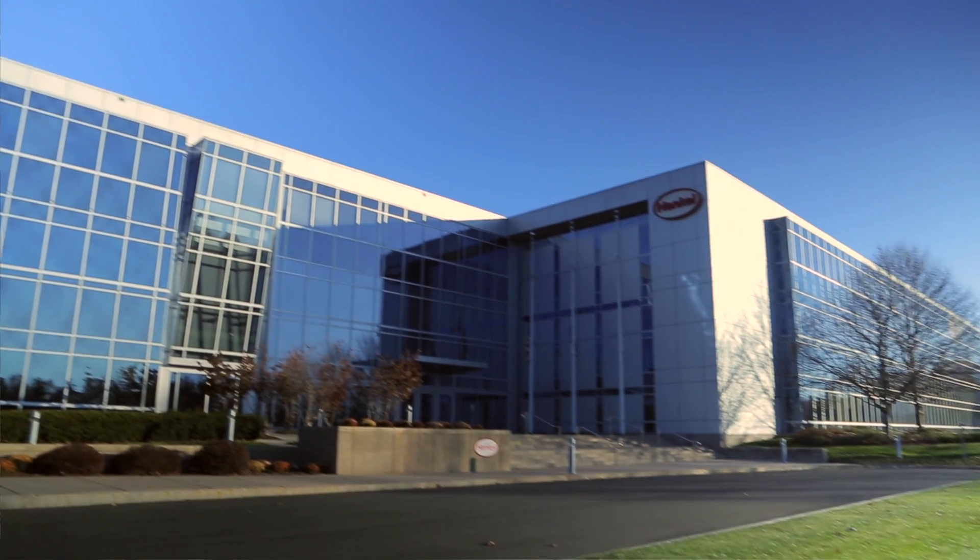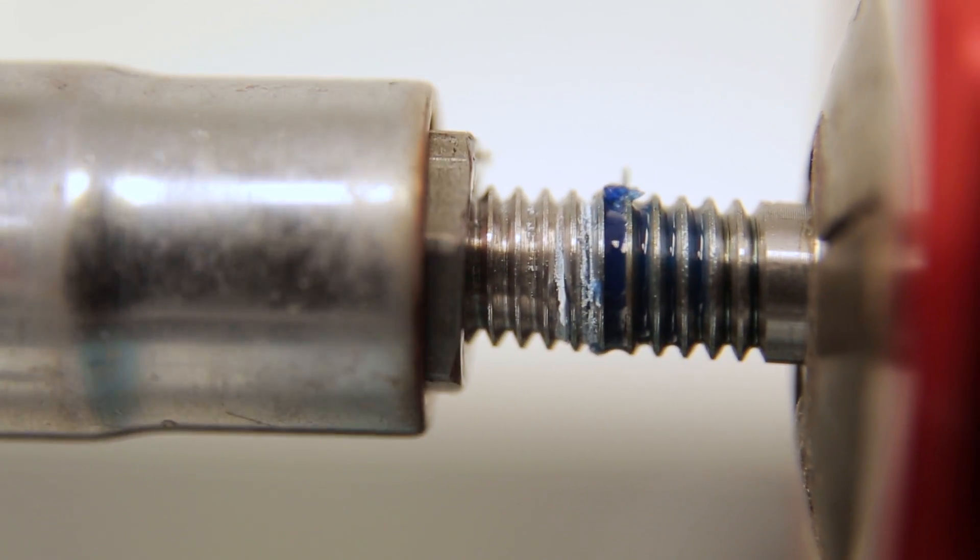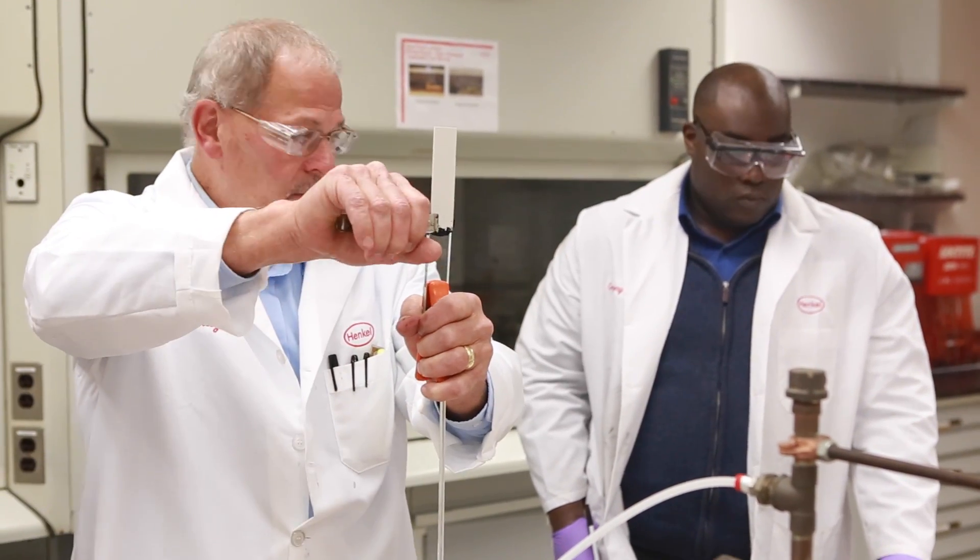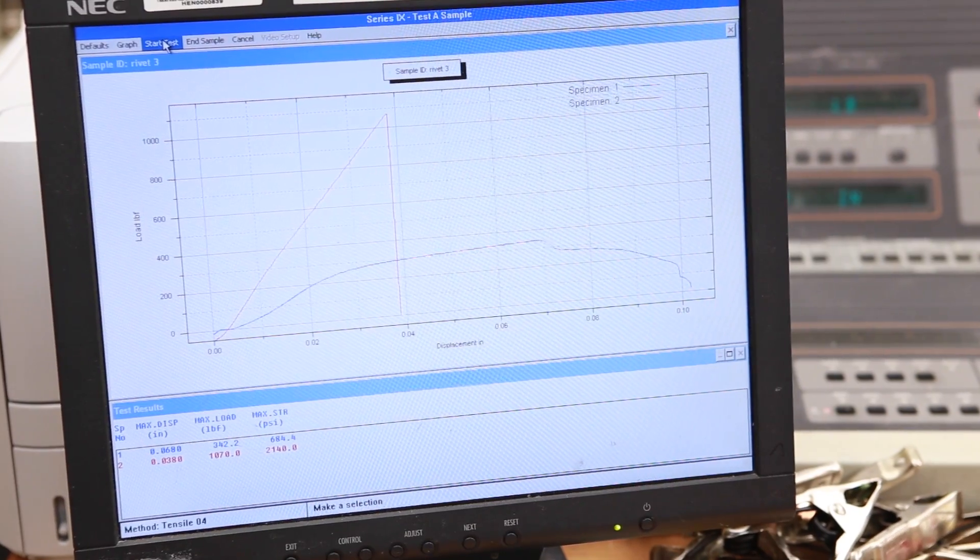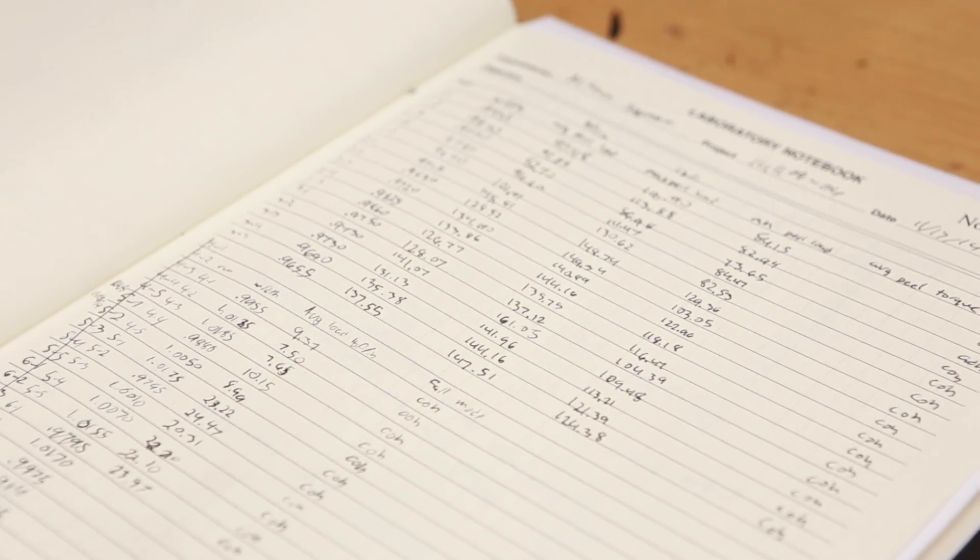Here at Henkel we run our products through an array of tests that help determine which adhesive solutions are right for our customers, allow for quality control at every step of product design and manufacture, and provide data that describe the material characteristics of our products.